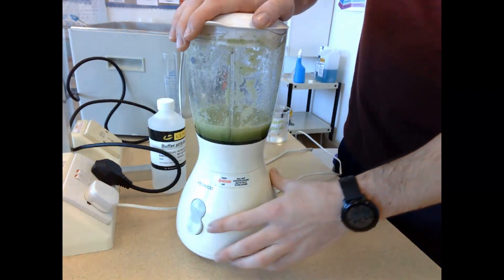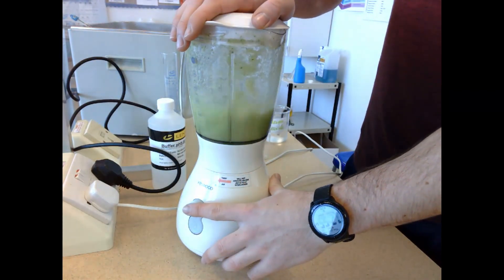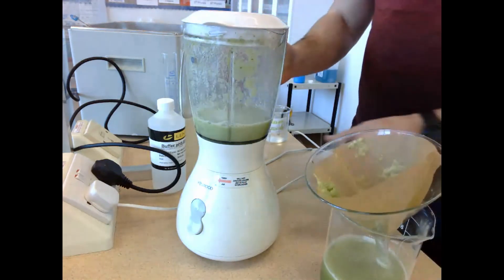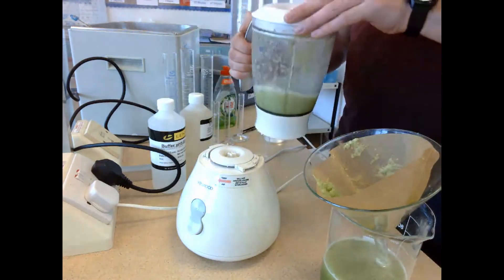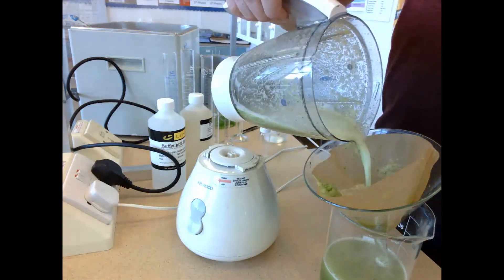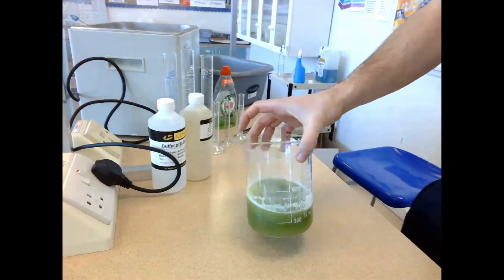This experiment is going to be looking at the effect of pH on enzyme activity. The first thing we need is our enzyme, and that is why I am blending up some celery with water to produce a celery solution that is going to contain the enzyme catalase. Here's one I made earlier.